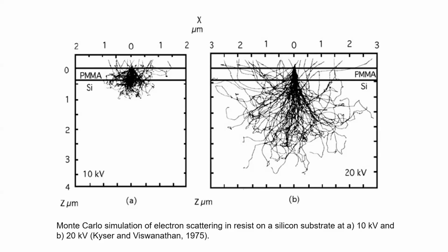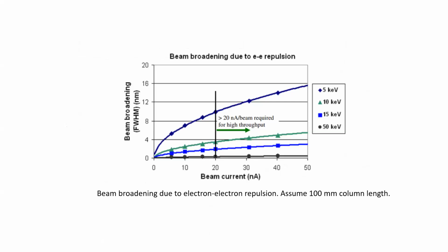Beam broadening in a thick specimen is difficult to calculate because multiple scattering is involved. For example, it is greater than or equal to 80 nanometers for silicon. The surface plasmon effects become negligible while the beam spreading becomes more significant, because more electrons suffer inelastic collision at larger scattering angles and more electrons scatter outside the finite collection aperture.